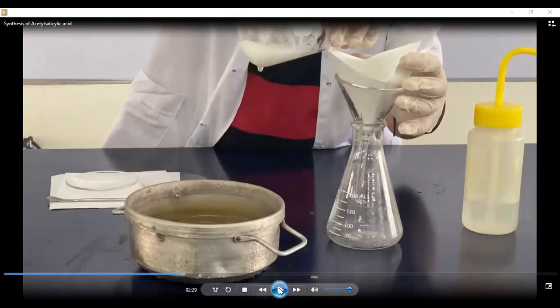So that is a common error when filtering. The setup of the funnel plus the receiver can be unstable. So always hold the receiver or the funnel, because just now ours almost fell.